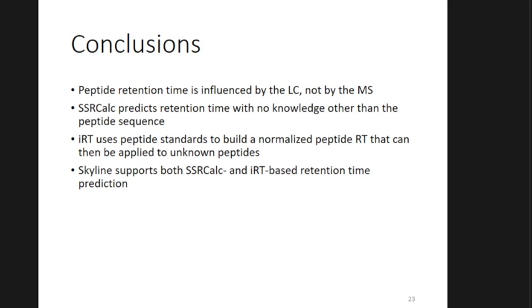So, just the quick conclusions: peptide retention time has very little to do with the mass spectrometer instrument itself. It's the liquid chromatography section that, as a community, the LC-MS proteomics community doesn't want to think a lot about. LC and retention time are extremely important for your data quality. We can use SSRCalc to just use the amino acid sequence of our peptide targets, but even better is if we can use IRT with either an exogenous commercial kit or with peptides endogenous to our experiment. And Skyline supports both of these.